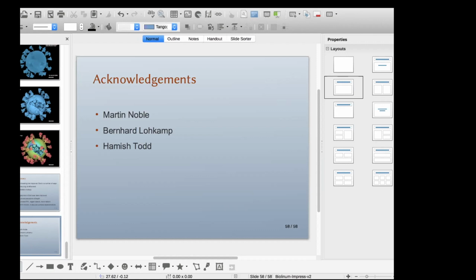It's straightforward for me to just grey out or not add in that menu item, because the build itself knows it doesn't support Guile. So as I'm constructing that dialogue, I can query whether that build supports Guile scripting, and if not, then just don't include those extensions. I'll make a note to do that now. Thank you.